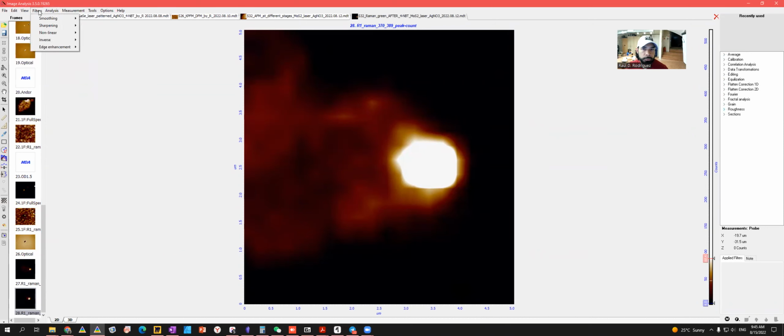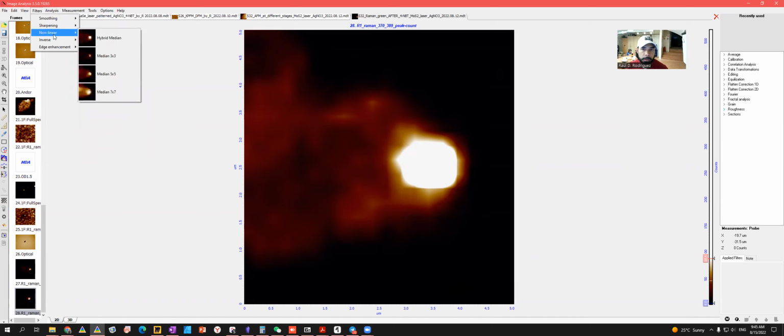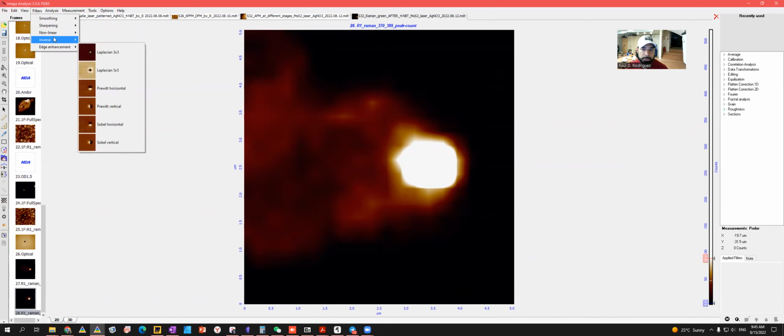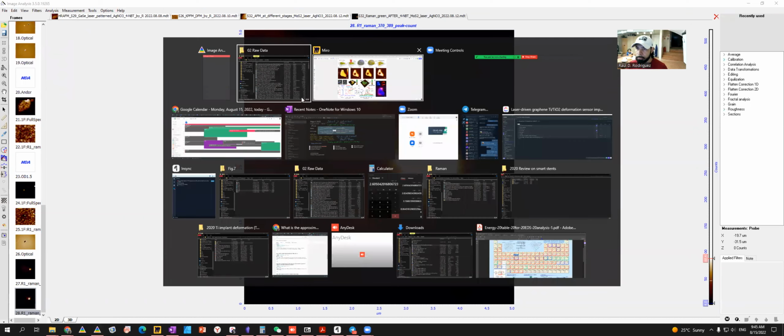I don't want a small thing. I want to see the raw data. But in here I don't see the option. Okay, we'll do with it.